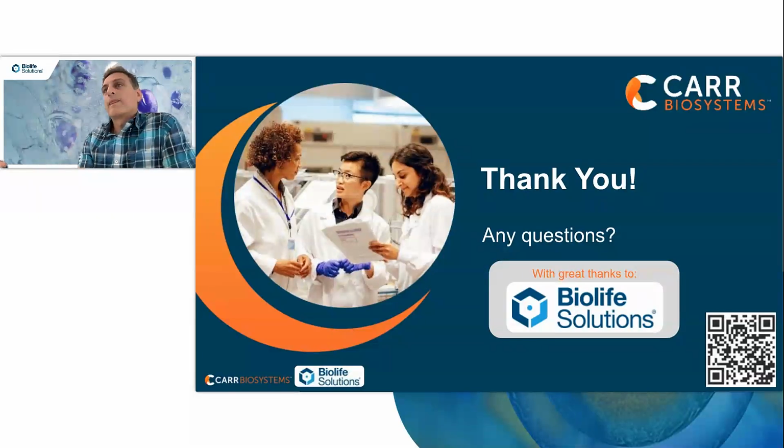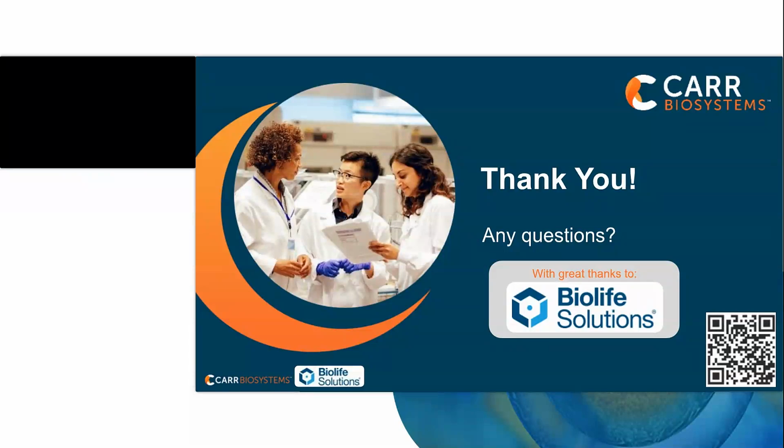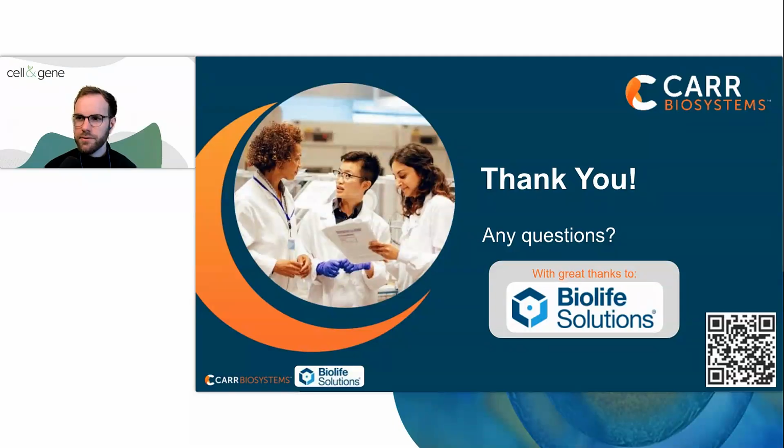All right, we have time for one more question. We have a multi-part question here. Do we need to get rid of cell clumps by filtration? What additional considerations are there to check the hold time? And are the analytical methods optimized for the cryoapheresis arm?